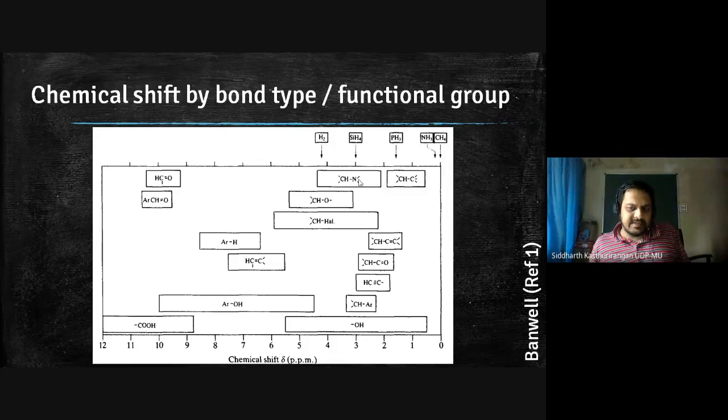So at one stage, the functional group analysis from IR and NMR will only give you what type of compound it is, but it will not be able to pinpoint many times what is the exact size of the compound. Let me take a simpler example. Suppose I give you methane, ethane, propane, butane, pentane, hexane.